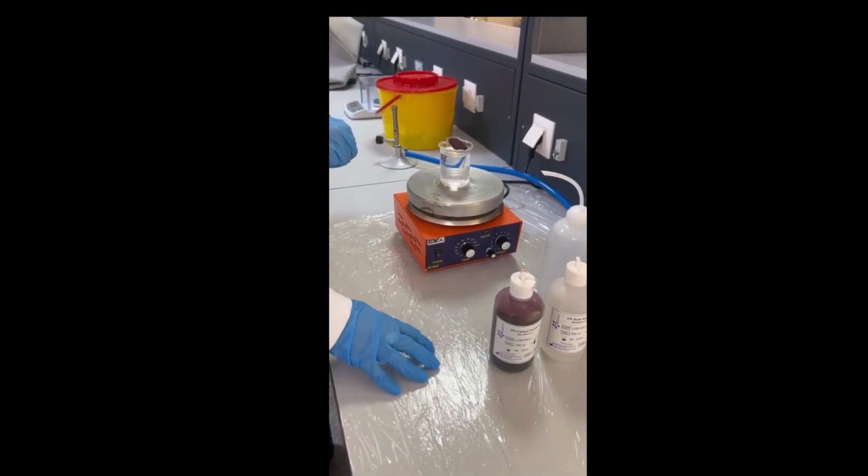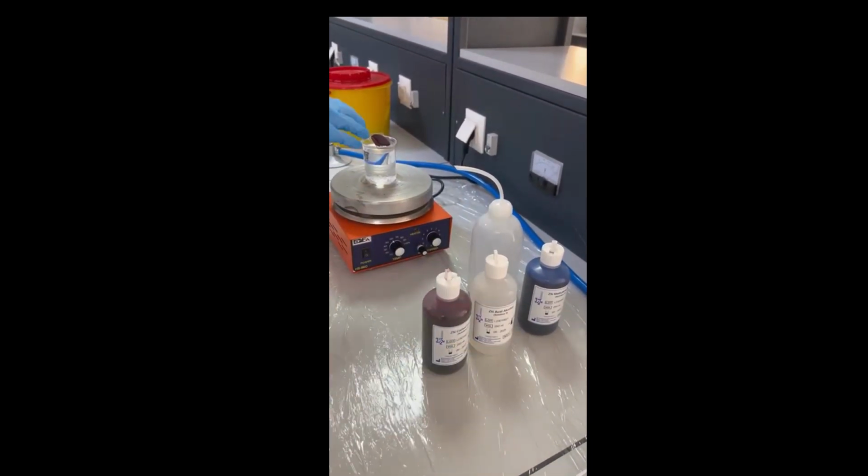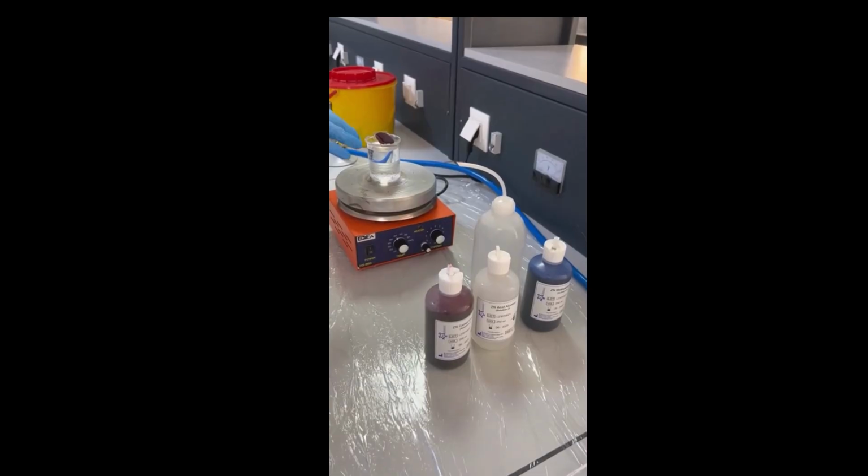So you know the bacteria is colorless. We add the red stain. Both types of bacteria will take the red stain.